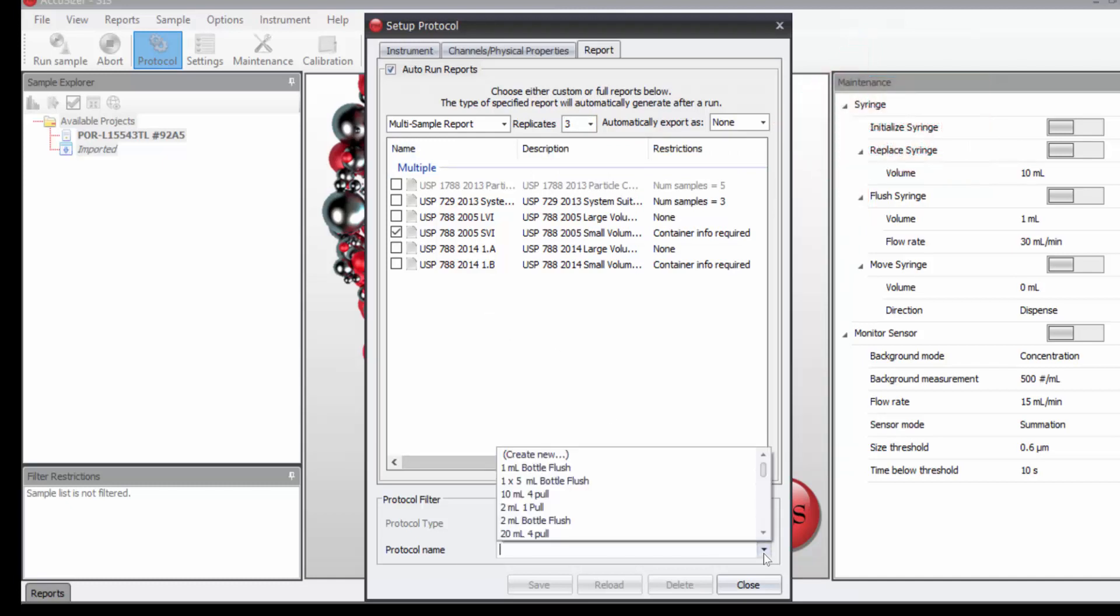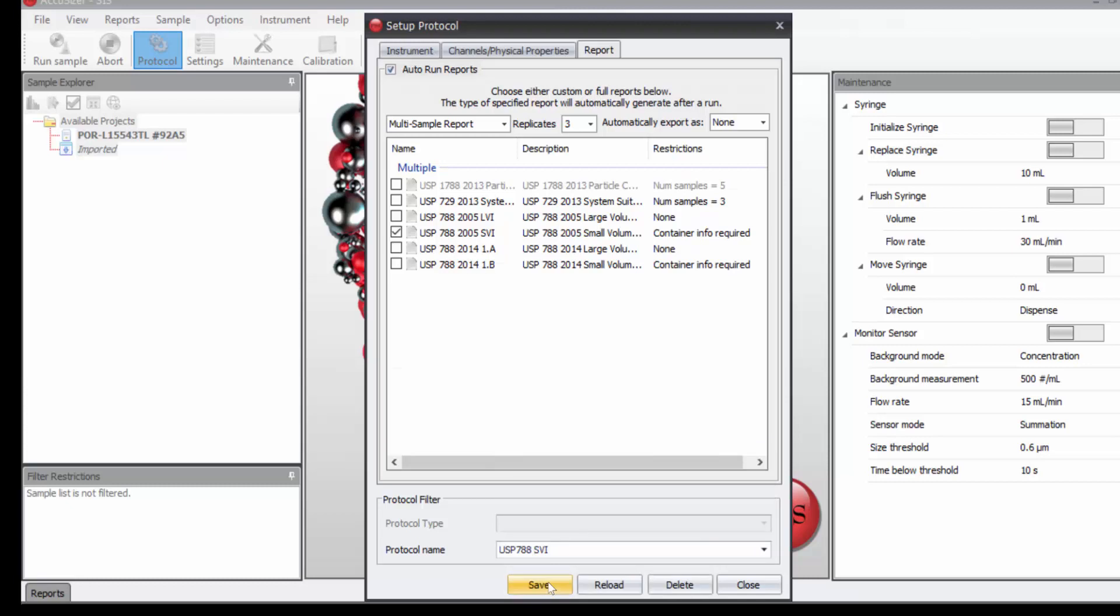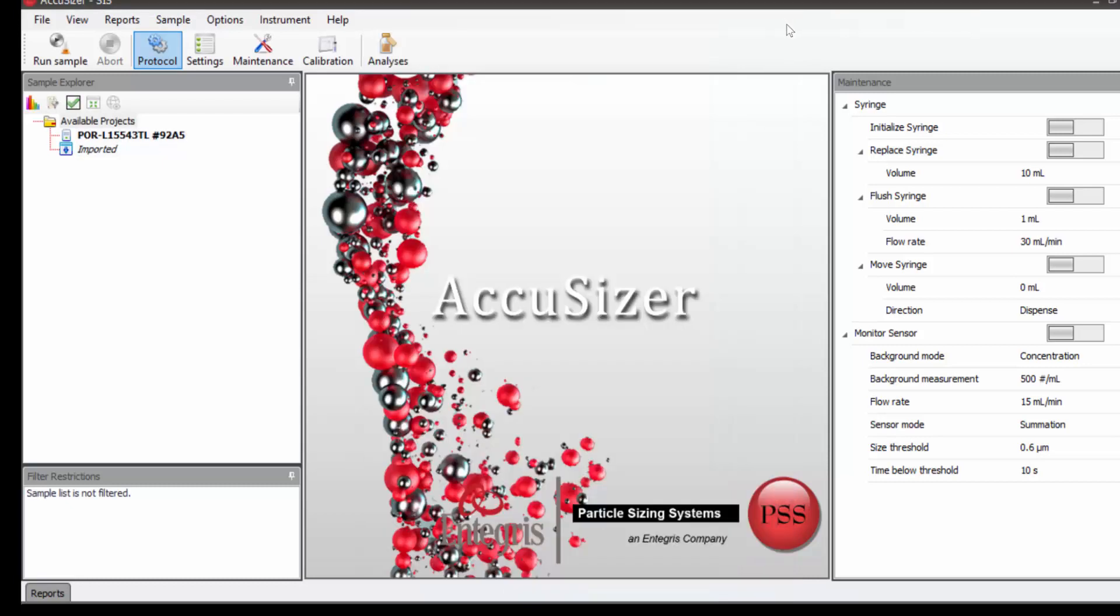And finally, I need to give this a name, which we will call USP 788 SVI. We will save this protocol, and now we have a protocol that will automatically run USP 788 and generate a report at the end of the measurement.